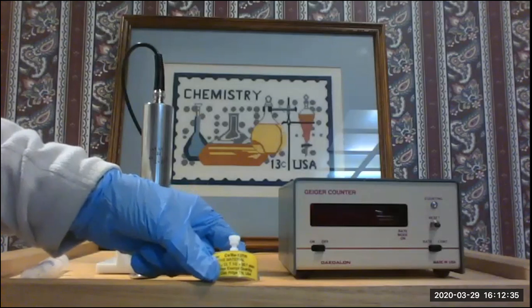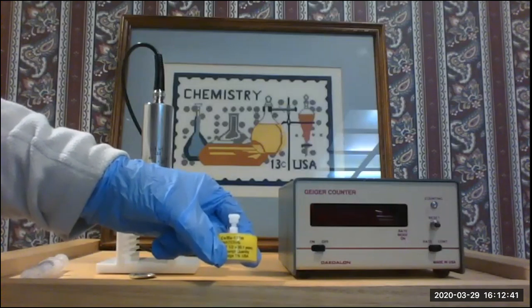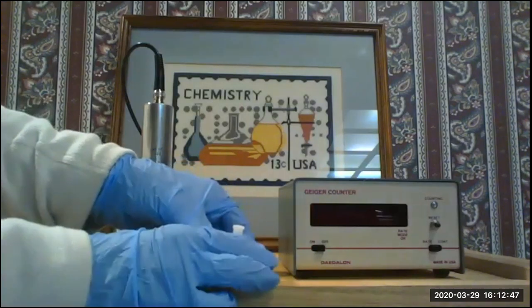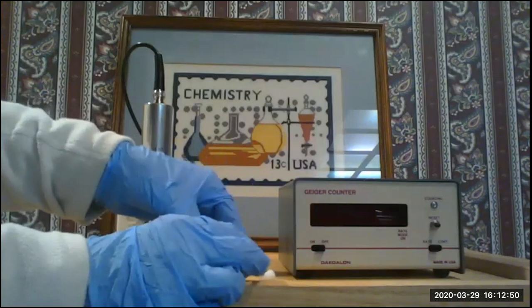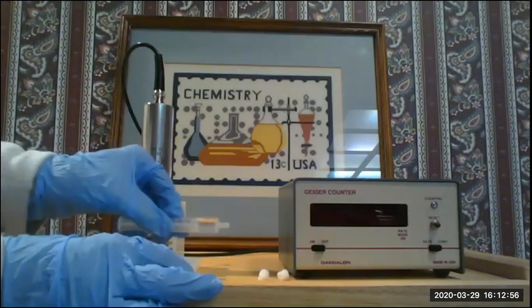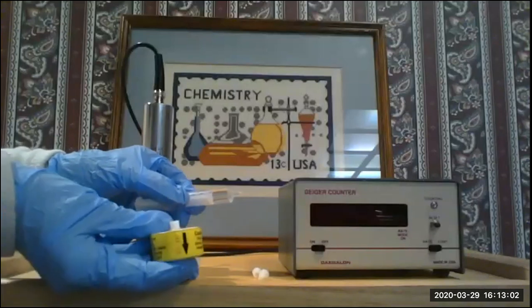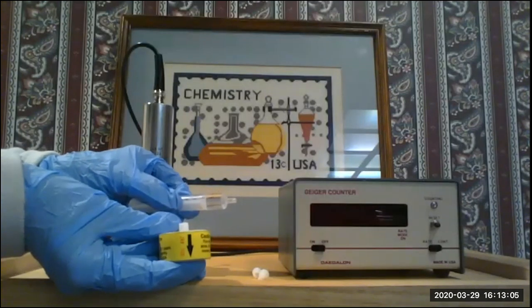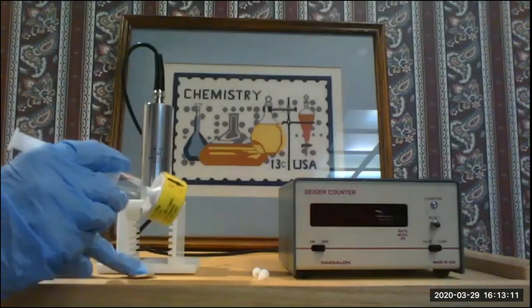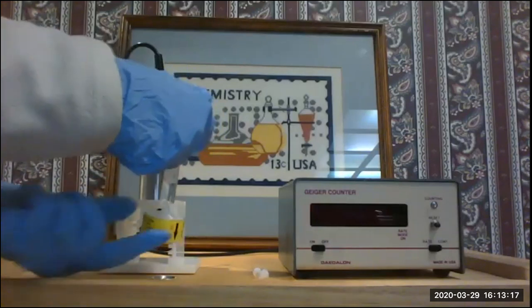So here we have the ISO generator that has the cesium inside that is constantly decaying to our metastable barium-137. It has a cap on either end that I'm going to remove. And here I have a syringe full of the eluting solution. The ISO generator has an arrow on it that tells me which direction I should push the solution through. And I am going to add a few drops onto a little aluminum tray.